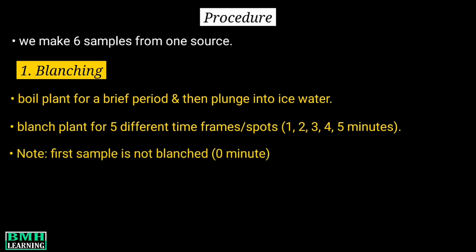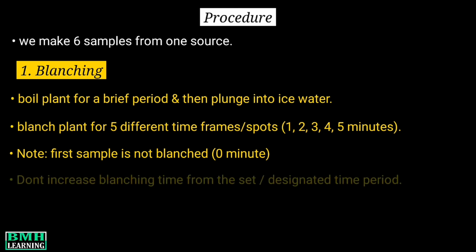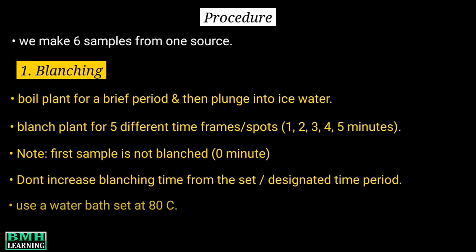This means the first sample is not blanched. Be careful not to increase blanching time, that is, if the second sample is treated for 1 minute, it must be only 1 minute and we should not extend it. And this applies to all samples. To do so, we use a water bath which is set at 80 degrees centigrade.